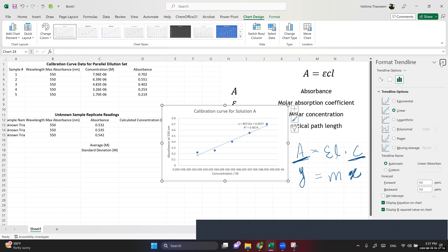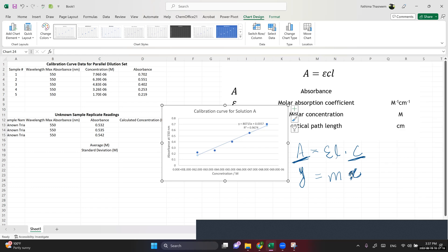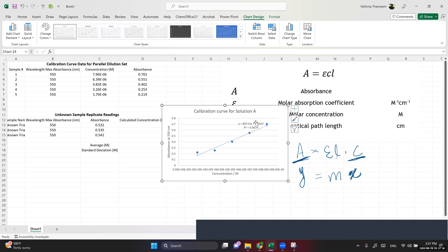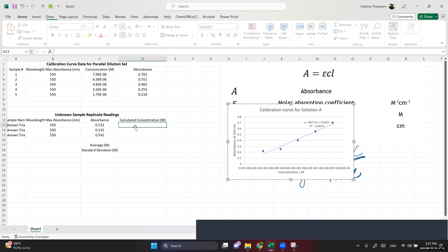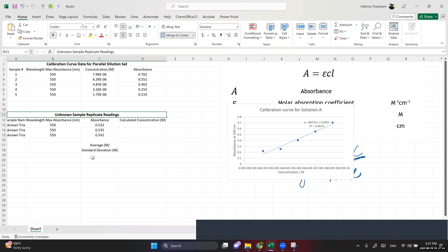We wanted y equals m times x, but we got y equals mx plus c — there's a small intercept due to instrumental measurement errors and other practicalities. That's still fine: y is the absorbance, there's a slope, and x is the concentration.